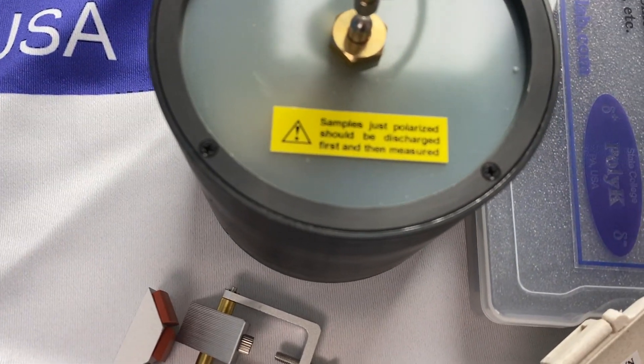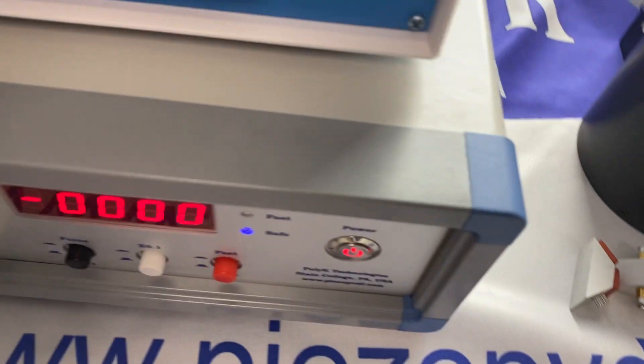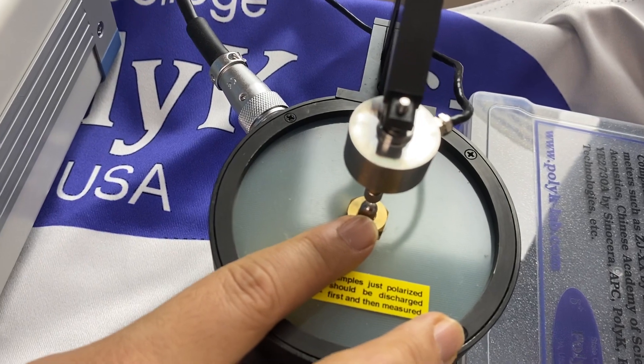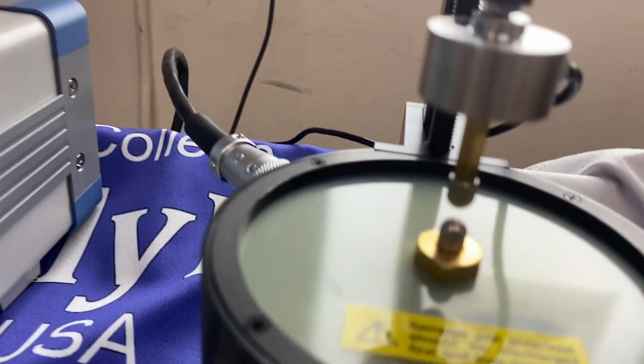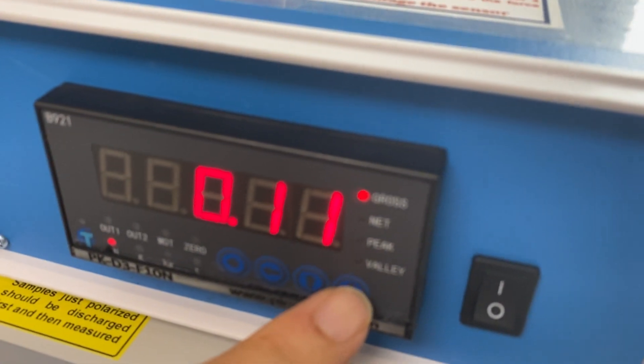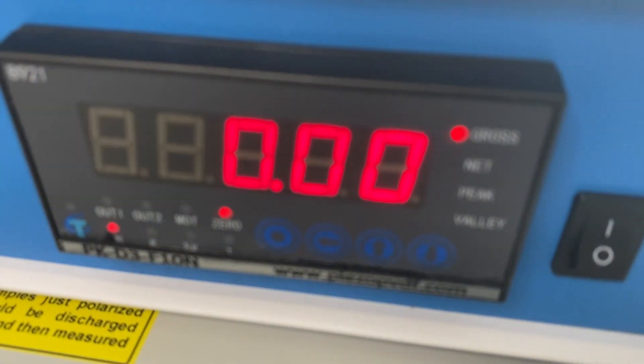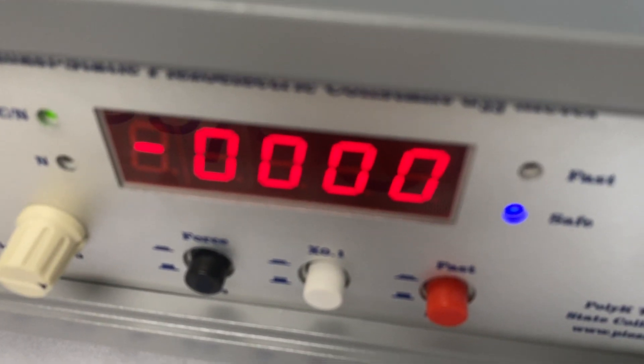Now let's check. First, let's check the force sensor. Right now, because the two electrodes do not contact each other, the force should be zero. You can easily zero the force by pushing the down button for three seconds. Now it's zero.